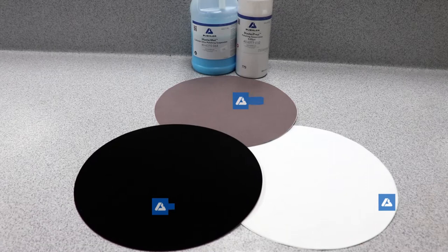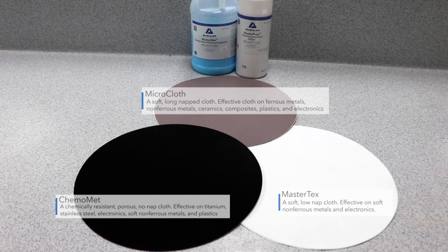Microcloth is a soft, long-napped cloth that provides an excellent surface finish on a wide variety of materials. Mastertex is a softer, low-napped cloth effective on soft, non-ferrous metals and electronics.